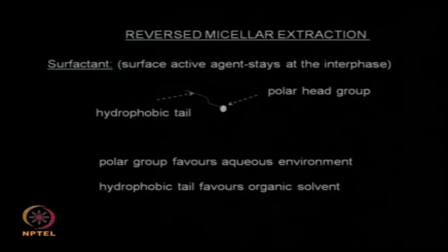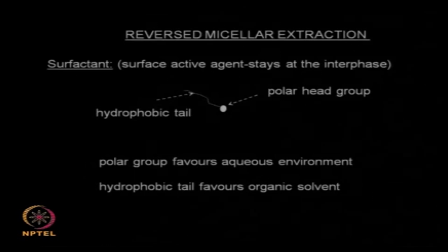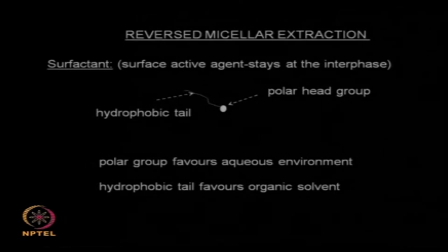There may be situations where you would like to transfer from one water phase to another water phase, so again you are talking about aqueous medium. So there are different strategies you adopt when water is also present, either as a solvent or as both the heavies as well as the lights. One of the important liquid extraction techniques is called reverse micellar extraction.